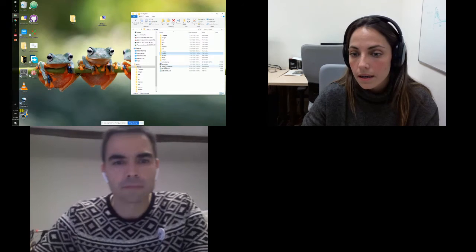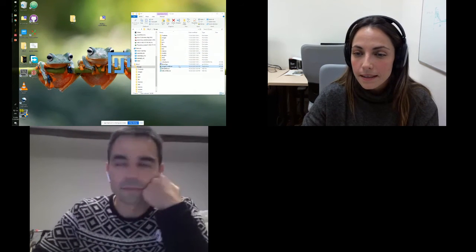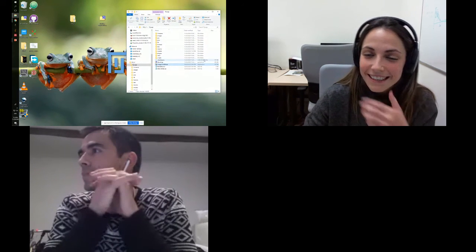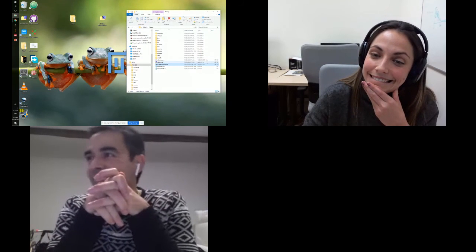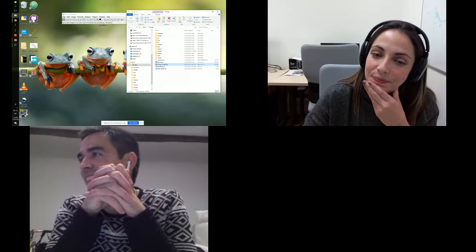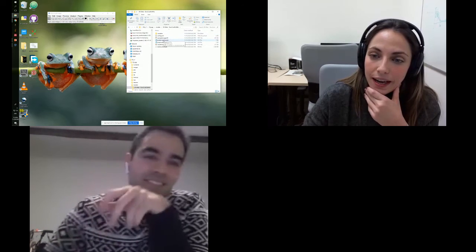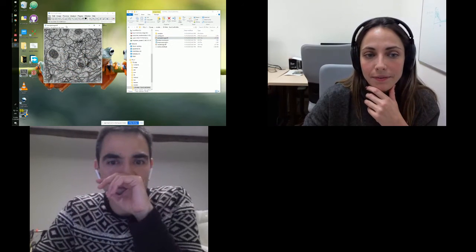Now I can open Fiji. It shouldn't take too much time. Okay, here we go. So I'm going to use the example image given within the model. I have it here.